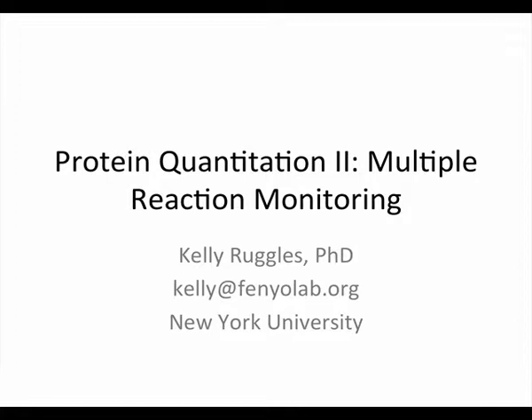So I'm going to go through protein quantitation, the second part, looking at multiple reaction monitoring, and of course, just ask me questions as we go if you have any.